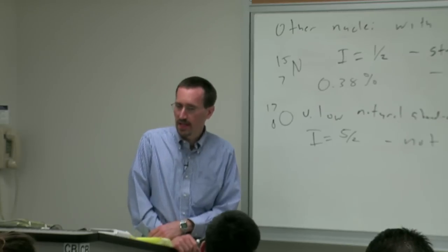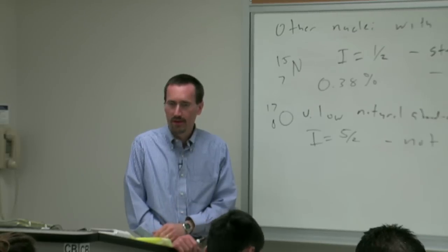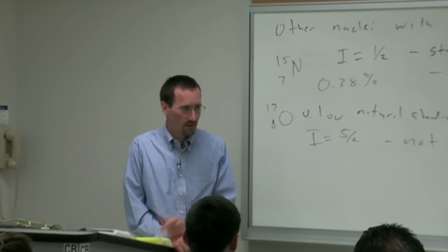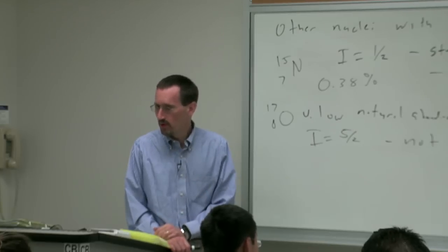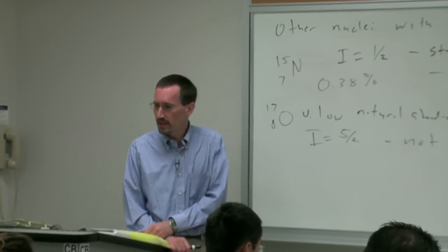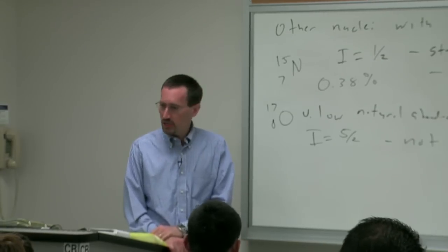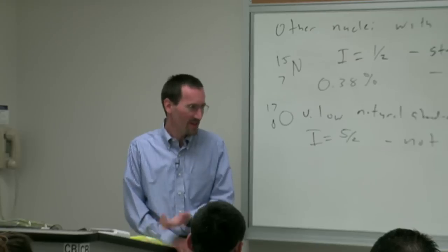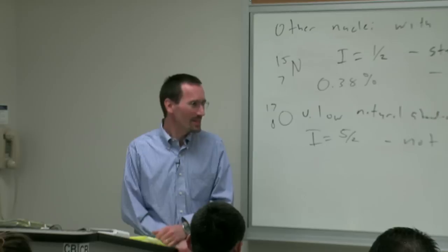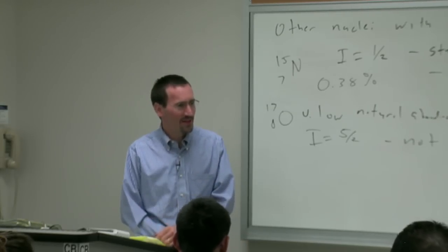Who's run a C13 NMR? Most of you. What solvent did you use? Chloroform, right? The first solvent most of us reach for because it's pretty cheap as solvents go and pretty good at dissolving organic chemicals. It's cheap because it doesn't have that much deuterium in it, right? You only have 1 deuterium for all that weight of chlorine. You need the deuterium to get the deuterium lock for NMR spectroscopy.